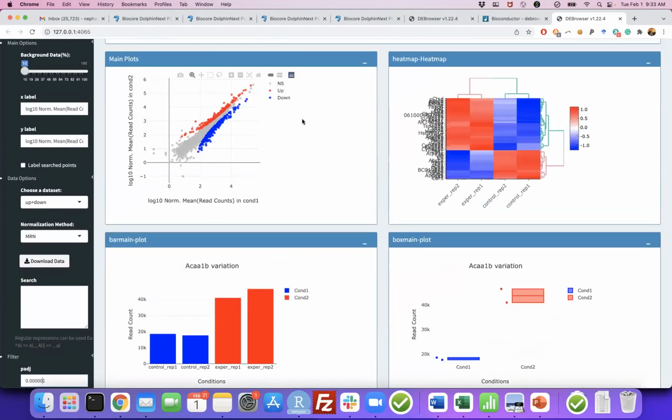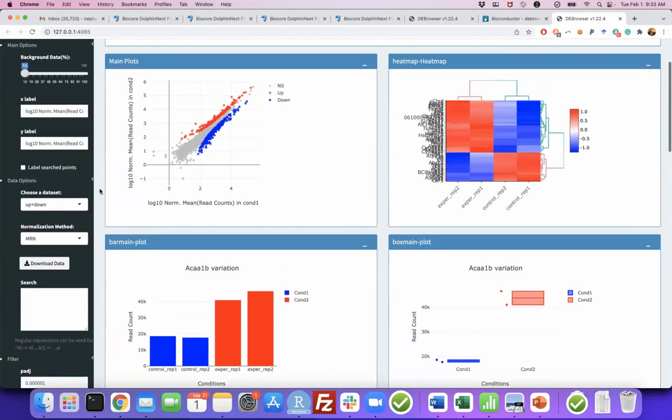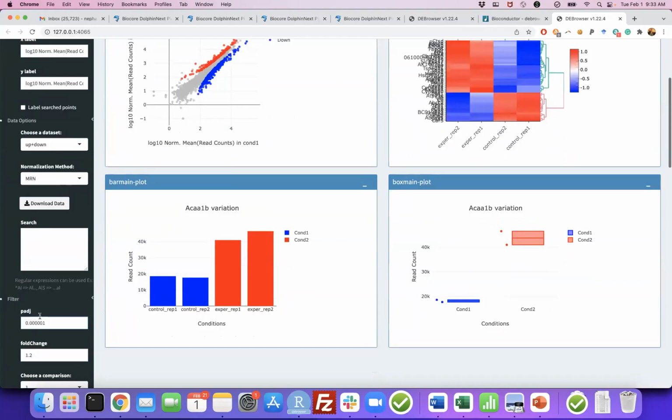So you can look at them, see. It looks interesting here. You can look like this too, 1.2, but these are very tightly regulated genes that you can get a list of and do your GO-term analysis. You can trust this more because there is a very low chance that they produce similar values. So see, they are like this, for example.